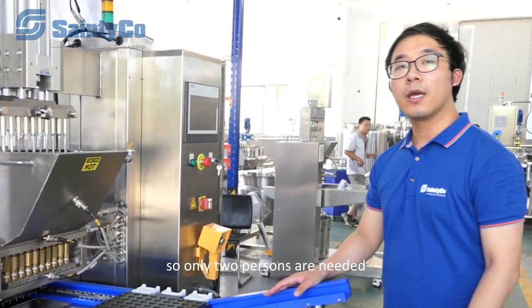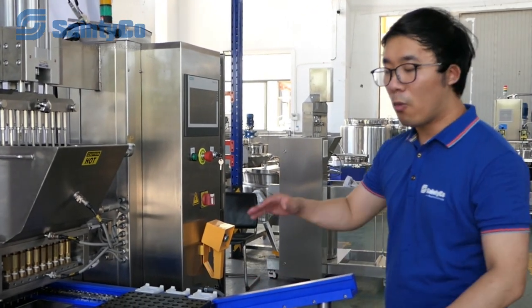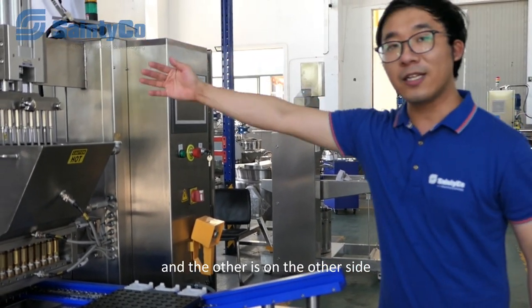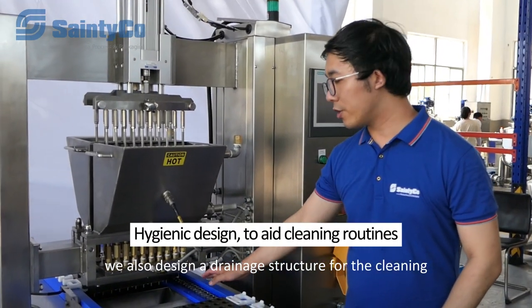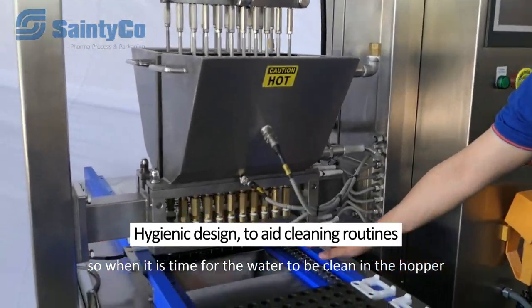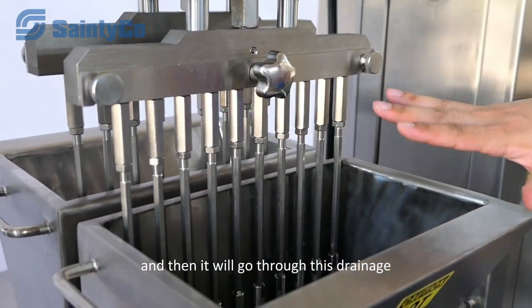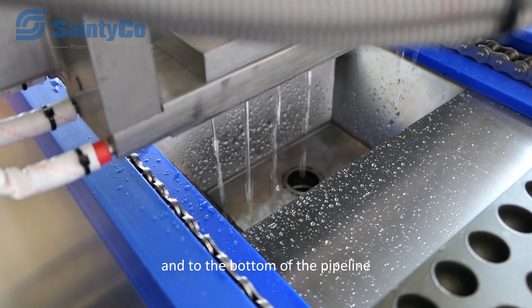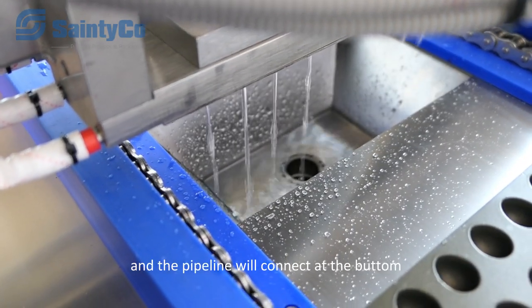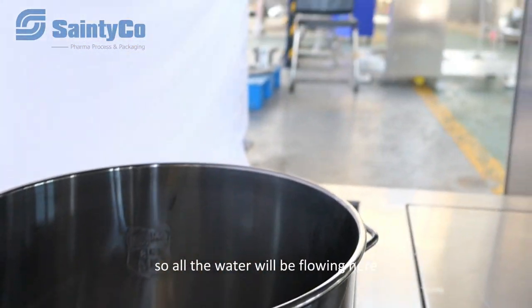Only two people are needed to operate this machine — one to load the mold on one side and the other to take out the mold on the other side. We also designed a drainage structure for cleaning. When it's time to clean the hopper, water will flow through this drainage to the bottom pipeline, and all the water will collect and flow out from there.